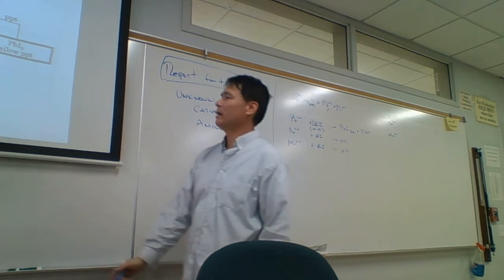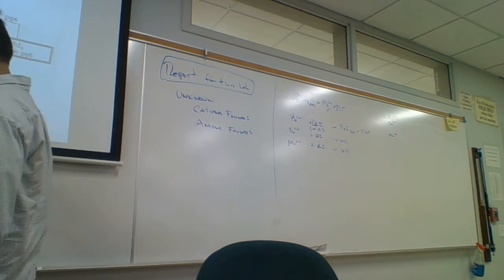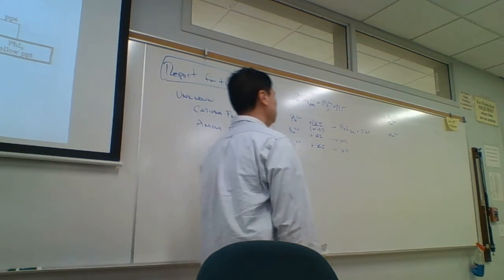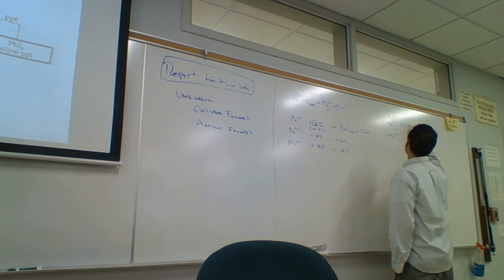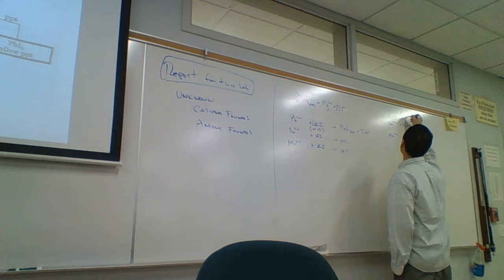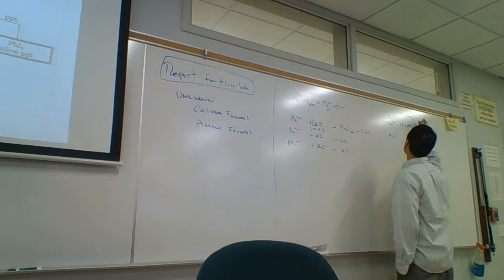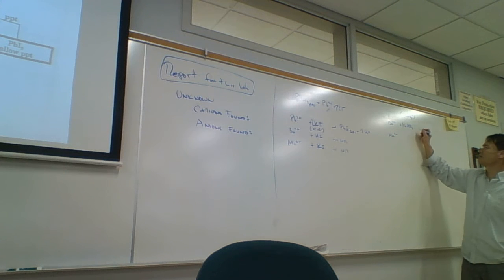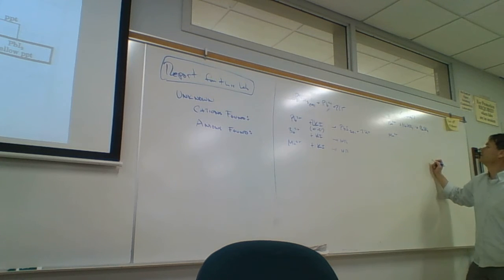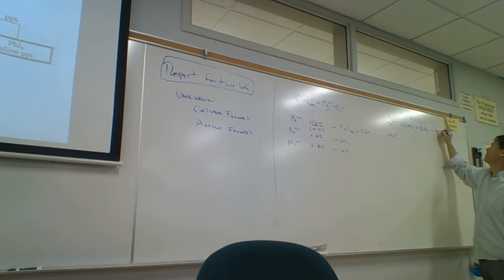So what are we going to do with barium and manganese? We're going to add sodium bisulfate here. Sodium bisulfate consists of sodium ions and bisulfate ions. Well, what's going to happen here with barium is barium likes sulfate, so it's going to knock the hydrogen off this, take the sulfate, and leave sodium ions and hydrogen ions.